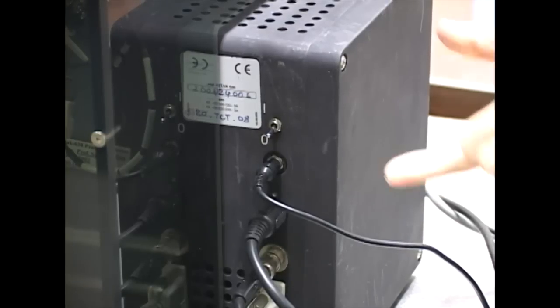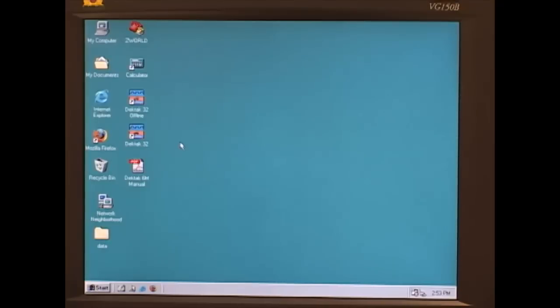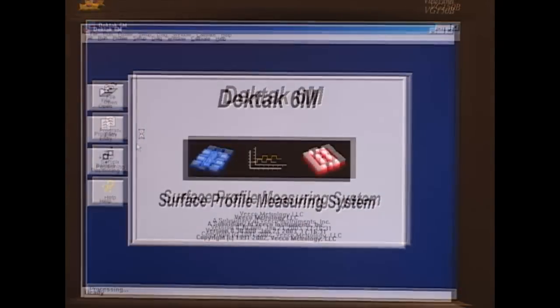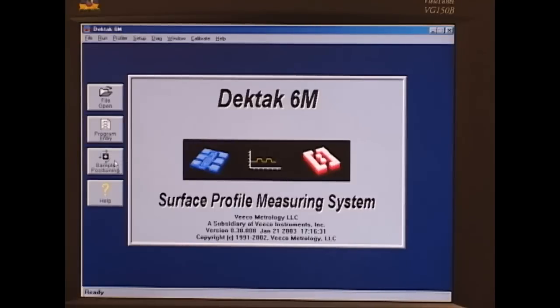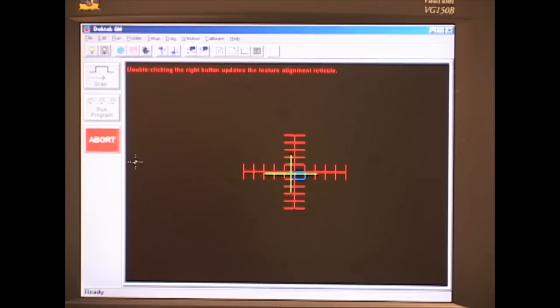After the computer has been turned on, we can go ahead and turn the instrument on, which is a switch in the back of the instrument. So we want to turn the DECTEC 32 program on. Once the program is loaded up, we'll click on the left menu, the sample positioning button. And that brings up a screen that will show us the camera view of the sample stage.